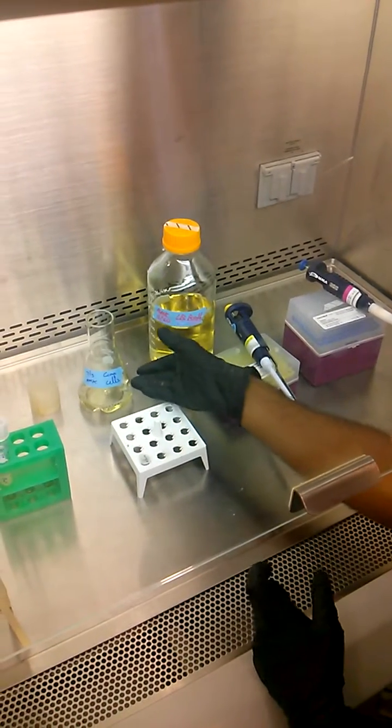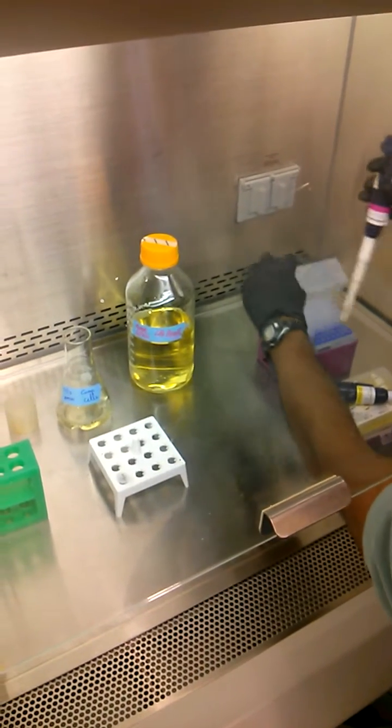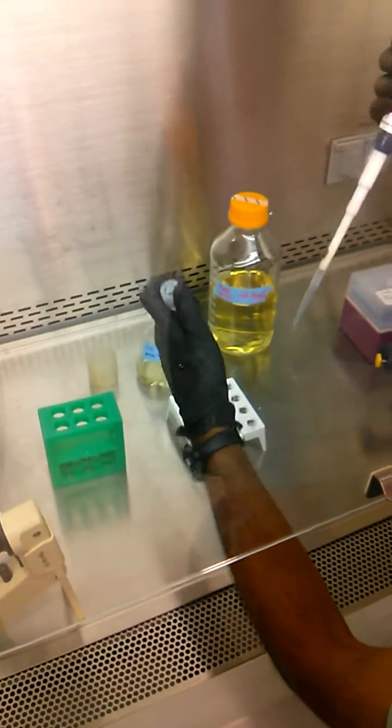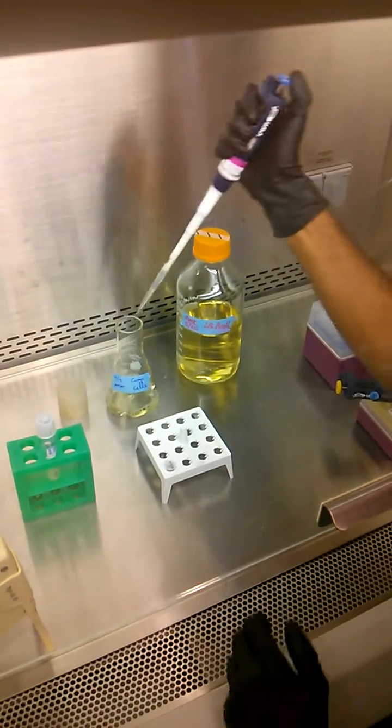Now that I have the antibiotic in the flask, I can directly add the culture. I'm going to add 500 microliters of overnight culture — so a one percent inoculum.